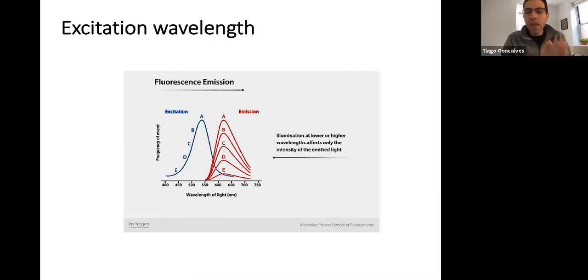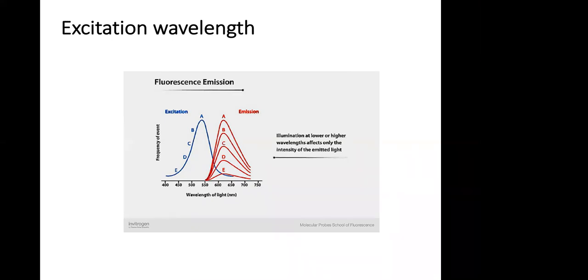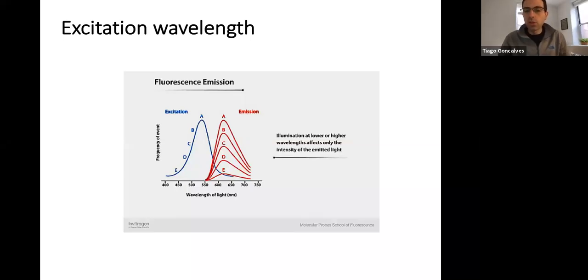No, what you want to do is really use A and use less intensity of A if you're photobleaching. If you're saturating your sensor, your imaging system, you don't want to use the same intensity, so you reduce the intensity. Using B or C will reduce your photobleaching, but you can't see what you're doing, so it defeats the purpose, because your main purpose is to see your fluorophore, and then you worry about photobleaching. In fact, it's a problem because you're going to be pumping more laser than you need in order to excite your fluorophore if you use B or C. Oh, yes, got it. Thanks.